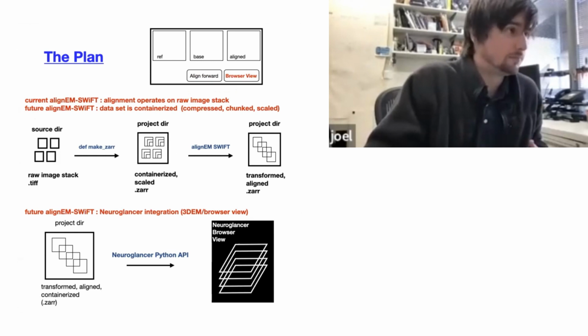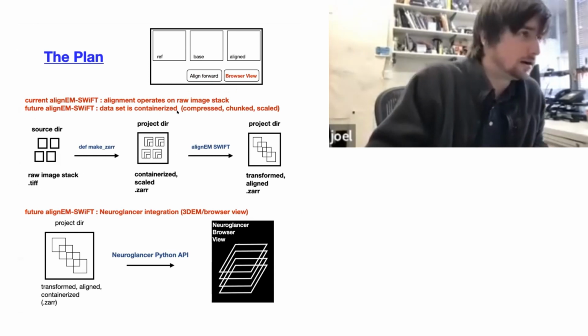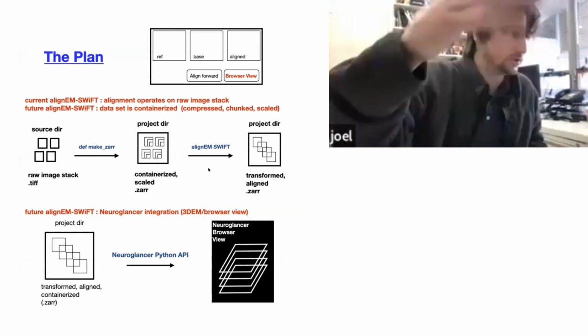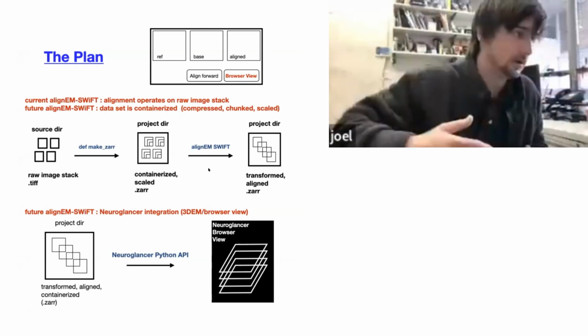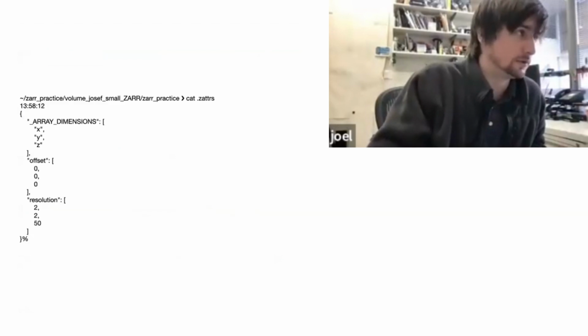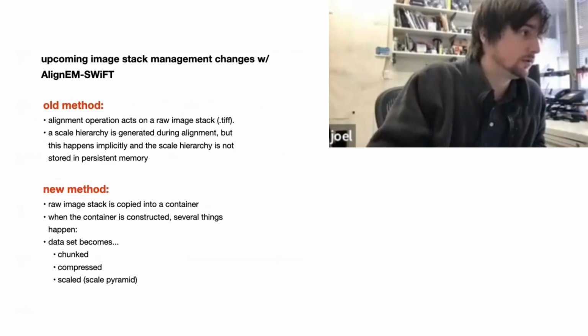So we've done that. And I'm just expecting you guys to see this slide. I'm not going to read it to you. But these are the two things: we want to get the data in this format, and then we want to set up the viewer. What I'm going to show you today is a script that does all of these things, just jam-packed into one script. It shouldn't be in one script. This should be modular, but that's just for demonstration purposes.